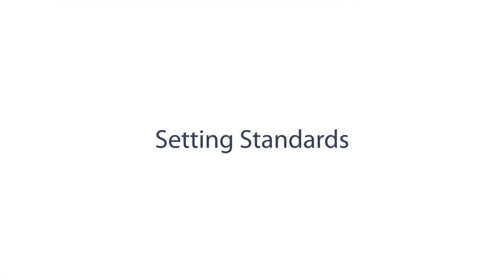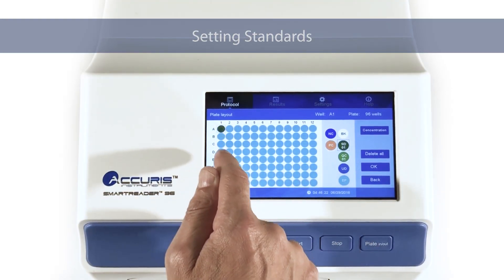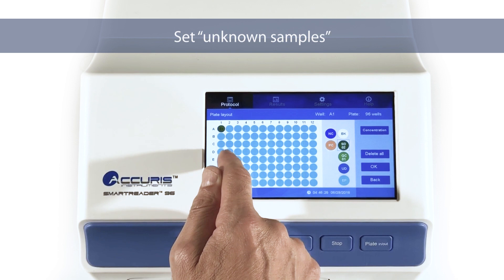Setting Standards. Press the Standard icon to open the menu to choose the standard number. Up to 12 standards can be set.